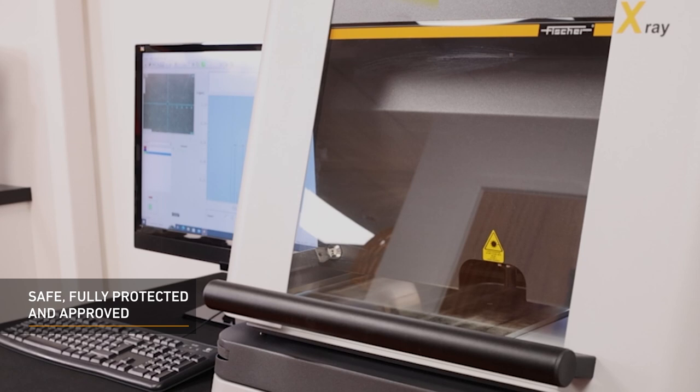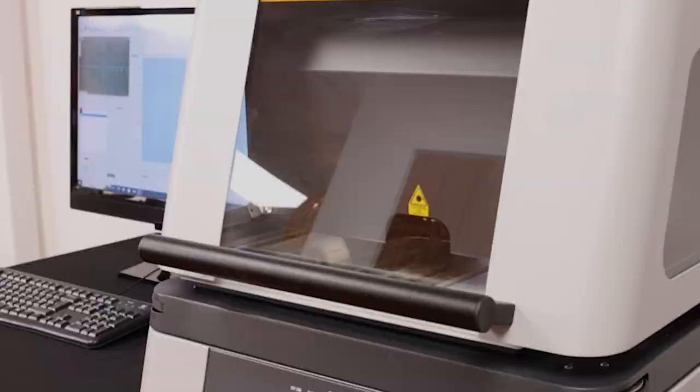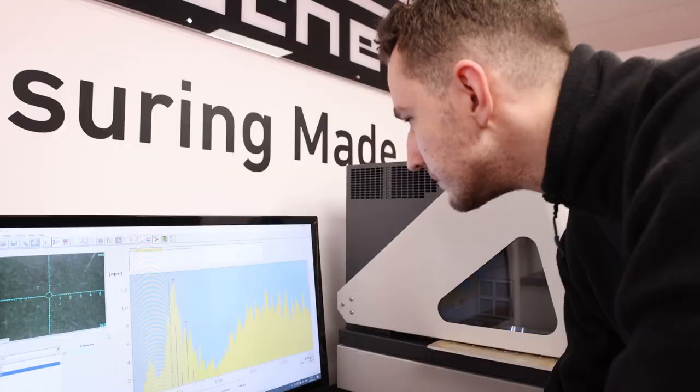Safety is of the utmost importance. The FischerScope X-ray XDL-230 is a fully protected instrument with type approval according to current radiation protection legislation.